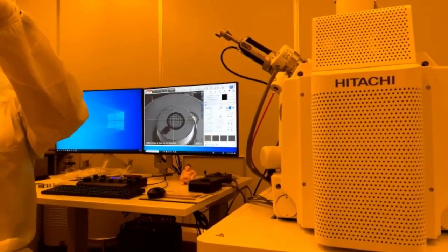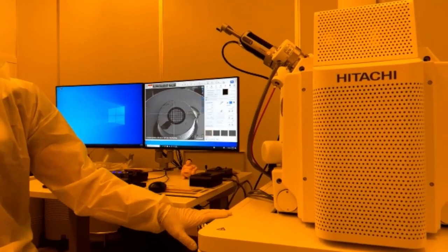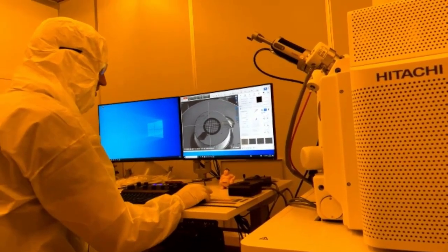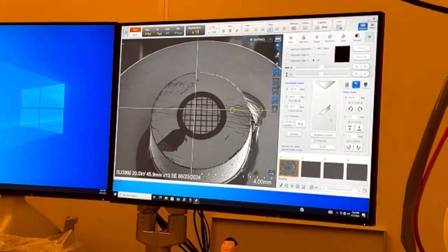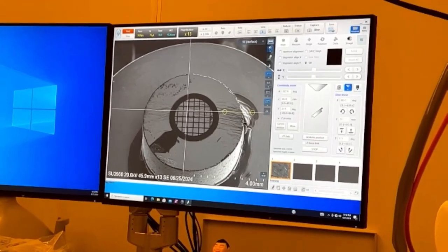So we're pointing at our sample. Maybe at times you all should make a note there, with a marker. Yeah, like a marker. I mean, you can always rotate your sample when it's in there, but once you load it, you have a frame of reference, you know.